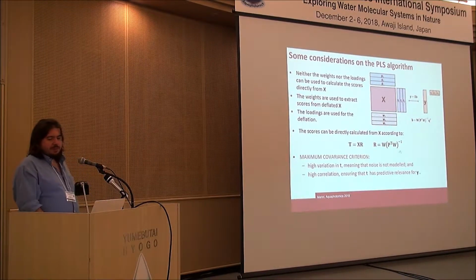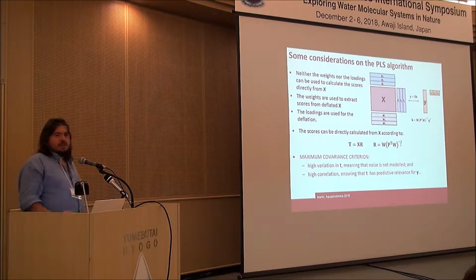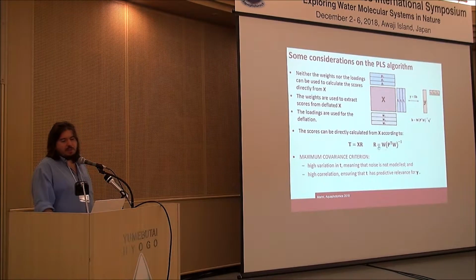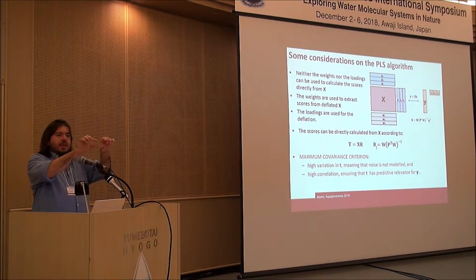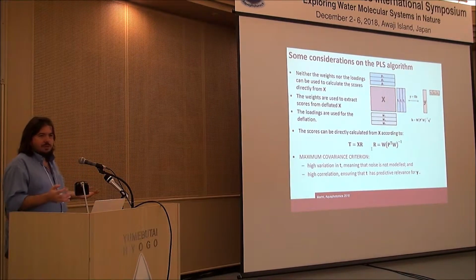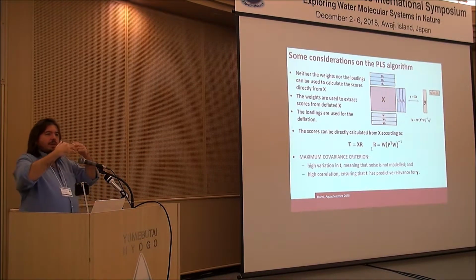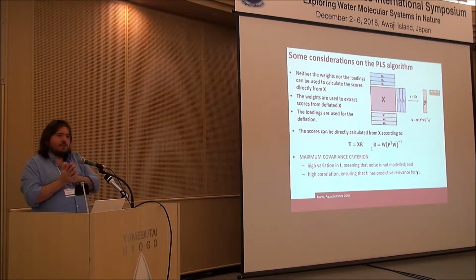Of course, one way of summarizing the two is to take this R coefficient. This is something that is normally done automatically when calculating the PLS regression coefficient. If you are not familiar with it, just think about what is normally done. Take the PLS regression coefficient, because they are just scaled versions of this regression weight. They are scaled by the value of the y, but this is exactly the loadings of, let's say, the spectral profile that results from the superposition of the two.